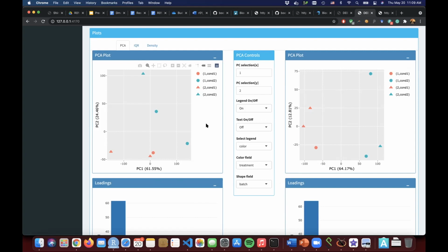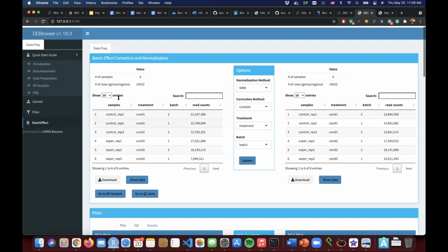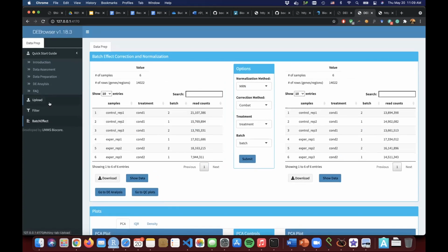The time points coming from different donors should be clustered together, not all donor samples clustered together. If that's the case, you need a batch effect correction using the donors as your batch. And after batch effect correction, actually we have that sample that Elisa showed in the demo section.